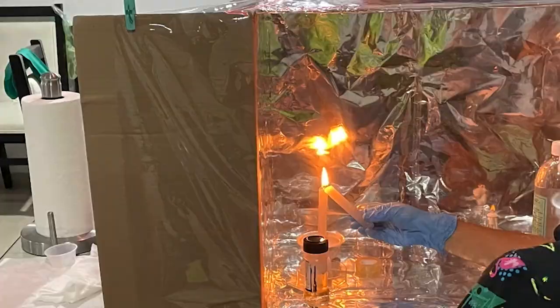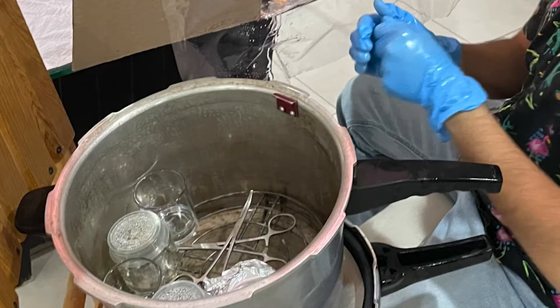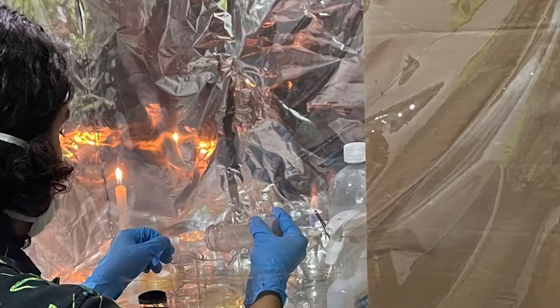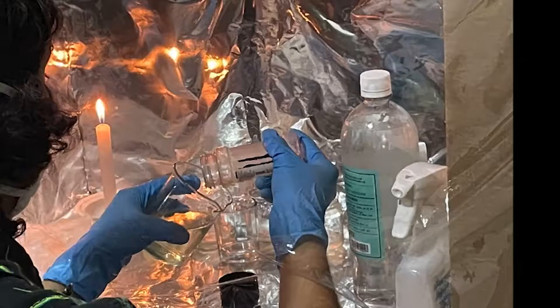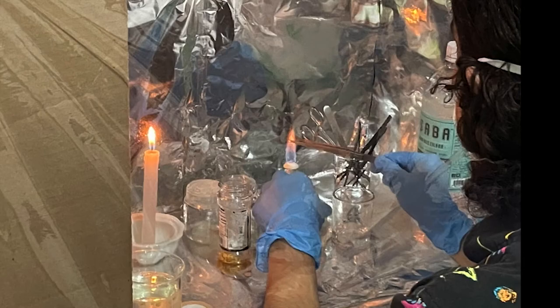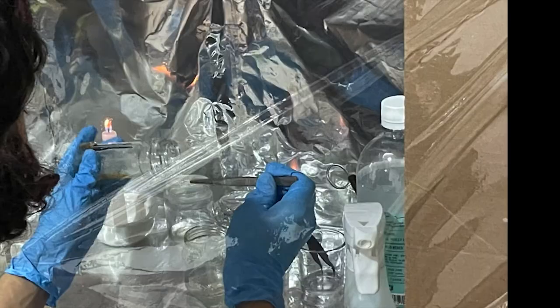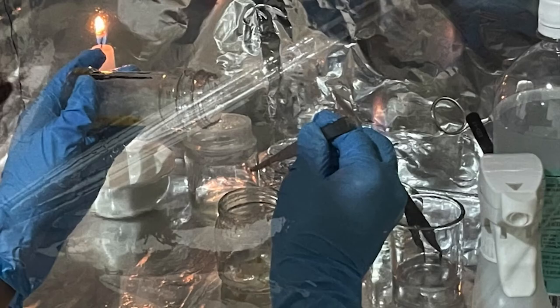The candles were lit, and the media and tweezers were removed from the pot. The seed rinses were done using sterilized distilled water. A tweezer was brought to the fire and allowed to cool to start. The seeds were taken one by one and 3 were placed in the first container.